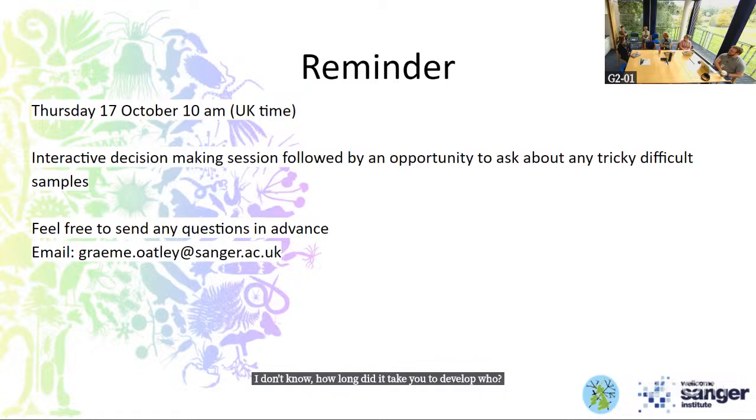So the plant organic extraction, the initial development phase was about 4 months of trial and error. It's still an ongoing process for a lot of samples. Like I said, it depends entirely on the phenotype you see. But yeah, I think it's always an ongoing thing. But the initial phase is normally a couple of months to get a general protocol that works for most things.